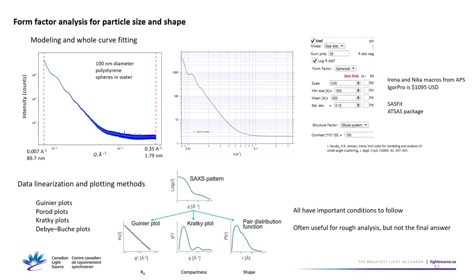Yeah. So what's the upper limit for Q in SAXS? It depends on the setup.